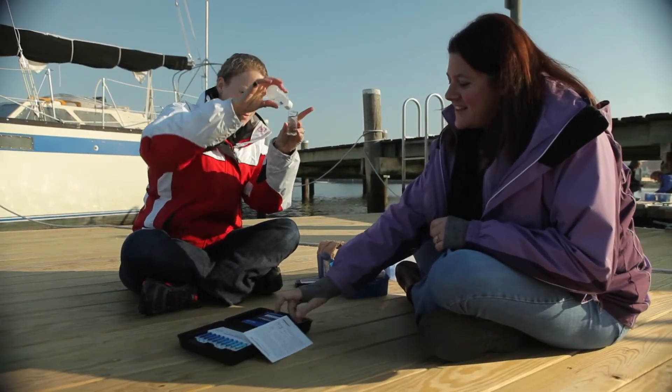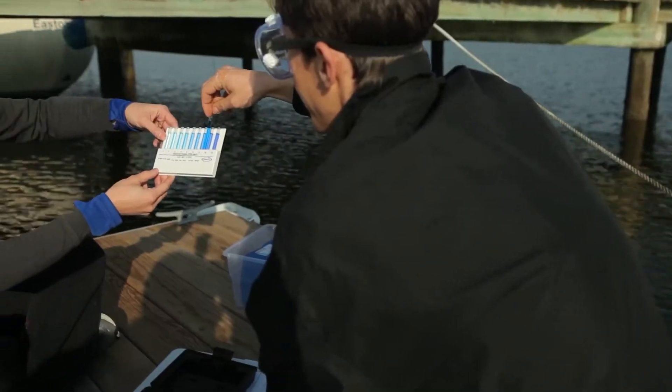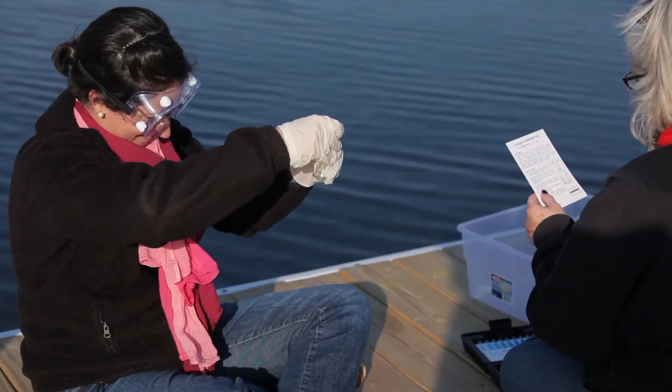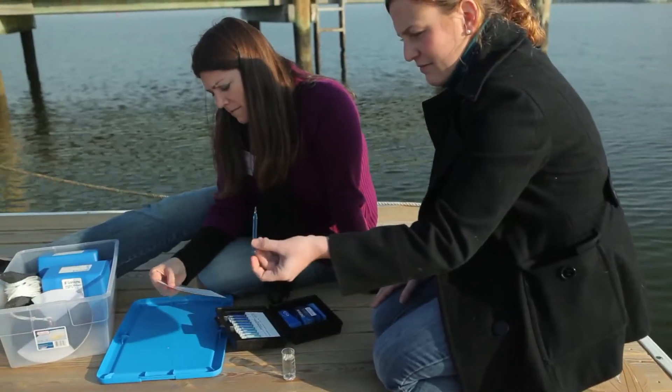They're just really simple to use — just a couple of easy steps. It's really fun to compare the colors on the comparator. The neat thing about the ampoules is once you break that tip, the vacuum just does all the work for you. The water gets sucked in and it almost immediately starts changing colors. I'm really optimistic they'll take them back to their classrooms and make good use out of these kits.